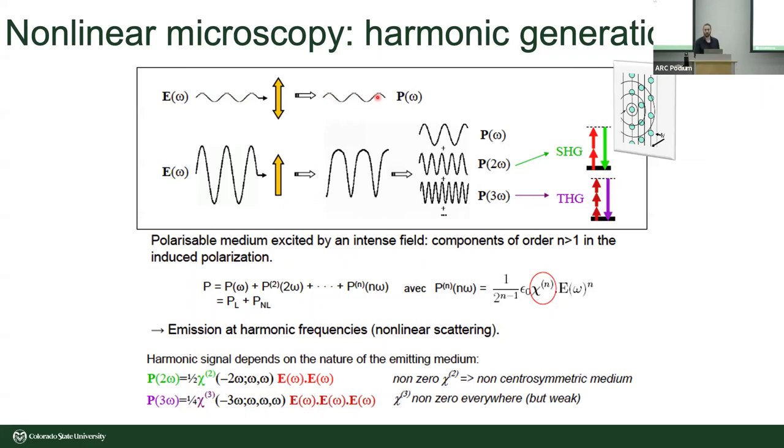So again, this is a very quick overview. We're sweeping lots of details under the rug, but you can imagine that as we illuminate with this one frequency, now our response has this anharmonic response, right? This polarization has an anharmonic response. You can decompose that into these different frequencies.